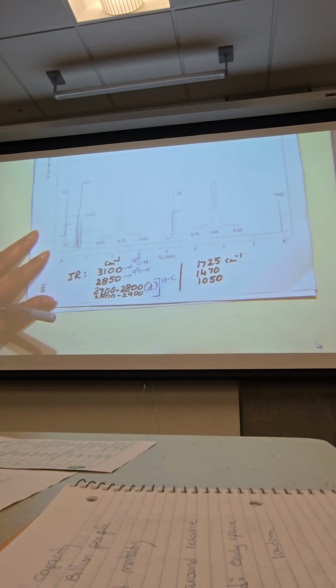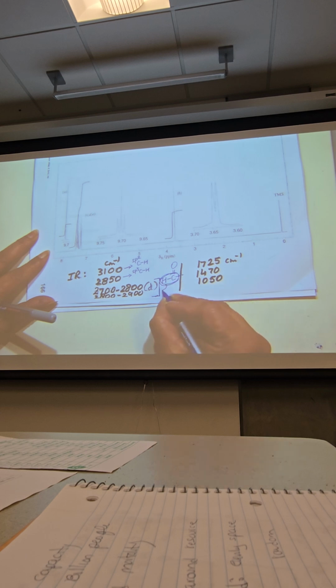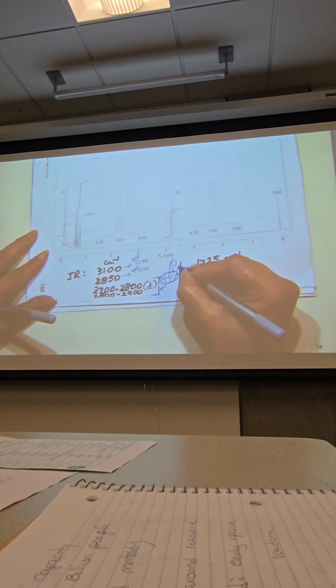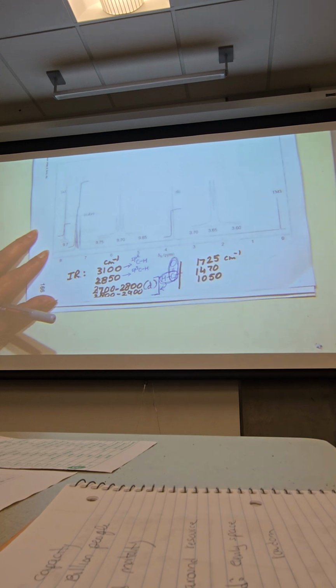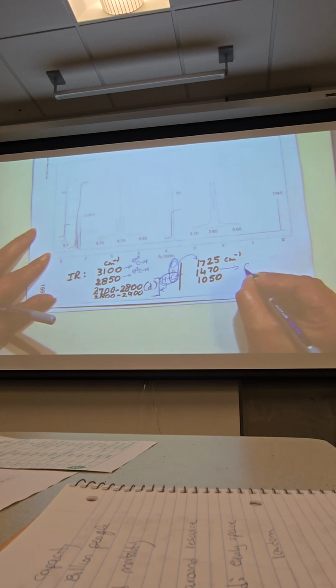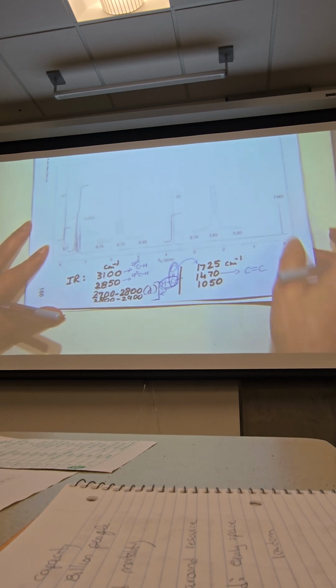The CH bond in an aldehyde group, this bond is being shown by the doublet. So what about this bond then? What about the C=O double bond of the aldehyde? Right there. Make sense? And of course that might be carbon-carbon double bonds, which makes sense, because if you have benzene, you also have carbon-carbon double bonds and so on.